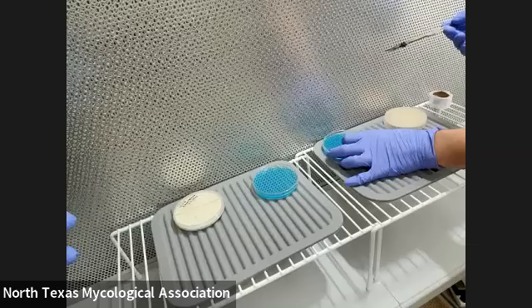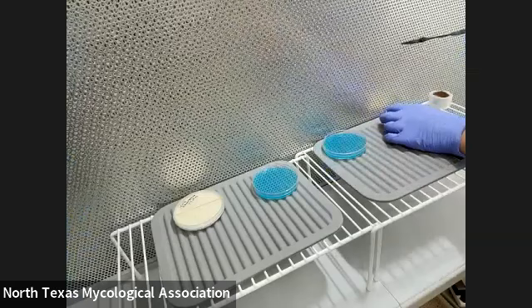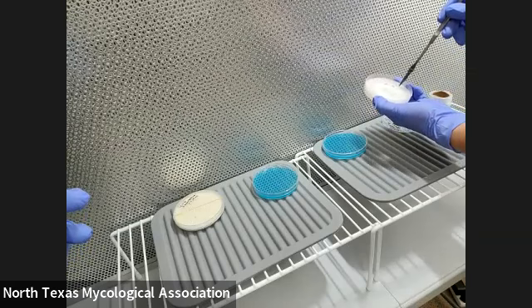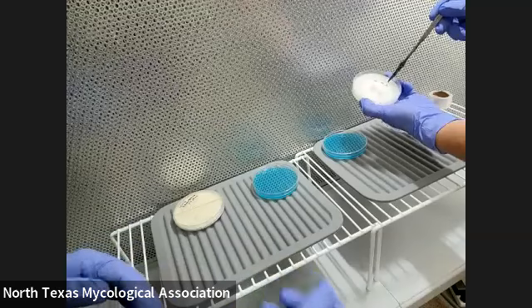I'm going to cool my scalpel in the sterile agar dish that I made, just so it's not burning our cultures. And I'm going to pick up and just cut like a square — you can do whatever shape you want, but I find a square works well.